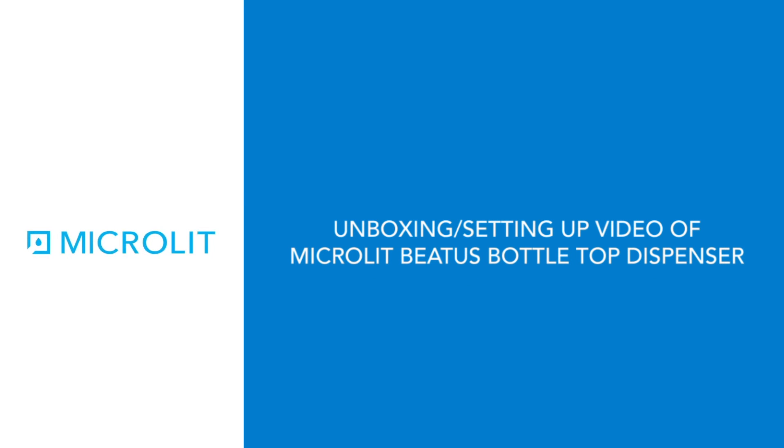Hello everyone. This is the unboxing and setting up video for Microlit's Beatus Bottle Top Dispenser.